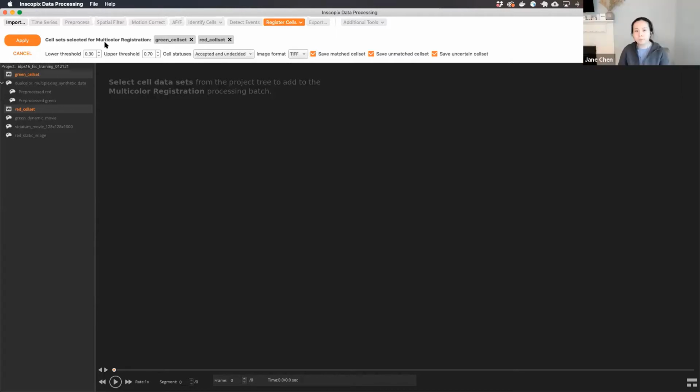If you're using ROIs for both green and red, then sure. But if you're doing CNMFE or PCA-ICA and then drawing really terrible ROIs for your red channel, then what I'm saying is you need to be consistent across the cells in your red channel. Consistently terrible, and then you set your threshold to that. Exactly. That makes sense.